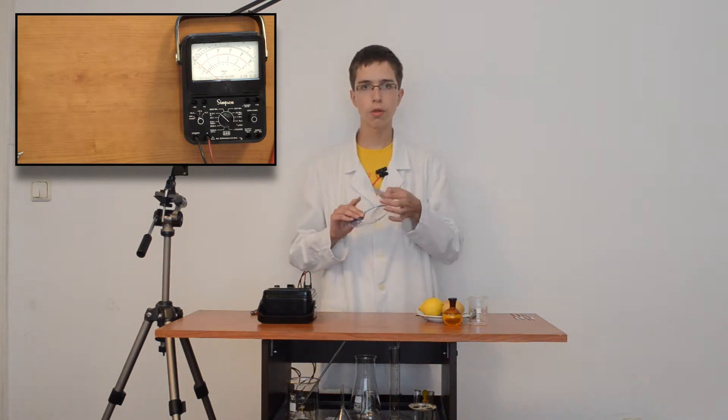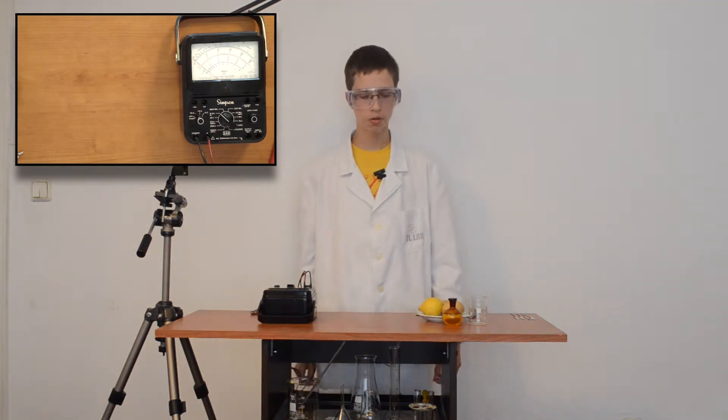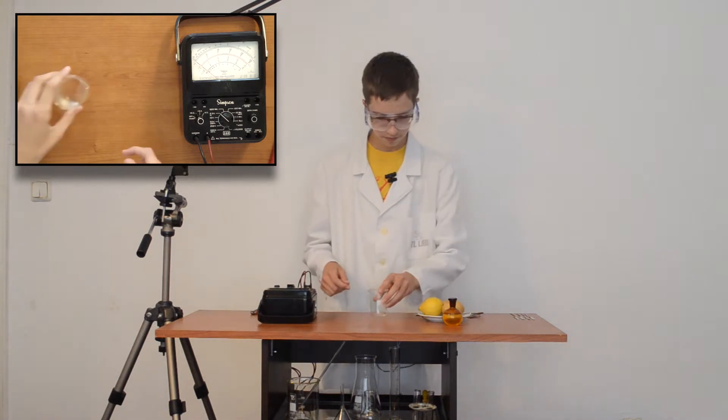I'll show you three variations of a galvanic acetic cell. First, I'll show you a battery made with acetic acid, or vinegar.